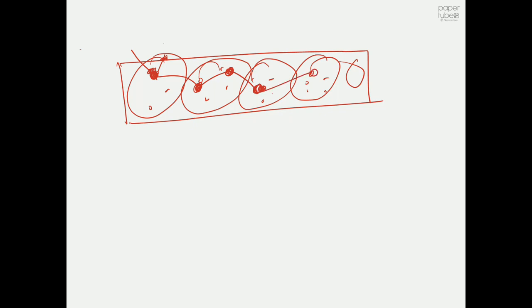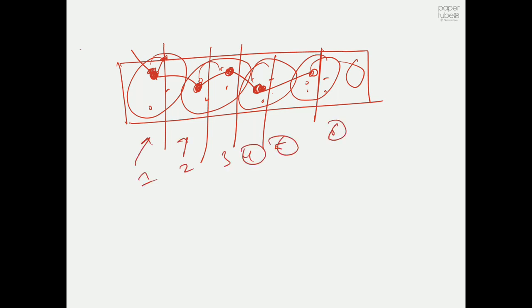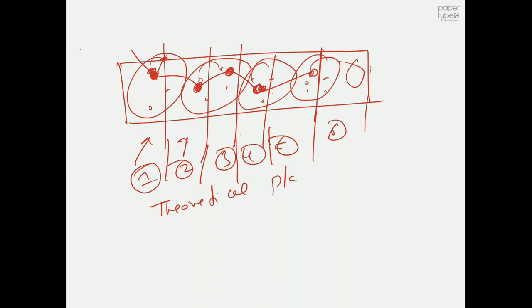So there is a sequence of equilibrium stages, if you want we can say like 1, 2, 3, 4, 5, 6. So we are talking about all these factors a bit slowly, because this is something related to theoretical plates. We will come back to this later when we talk about the theory of chromatography. Obviously there is no plate inside the column, but the number of equilibrium stages happening inside the column also dictates your retention time, and it's related to what we call the theoretical plates. So try to remember this word. We will come back to this theoretical plate later, like whether it should be very high or very low in order to achieve a clear separation and so on.